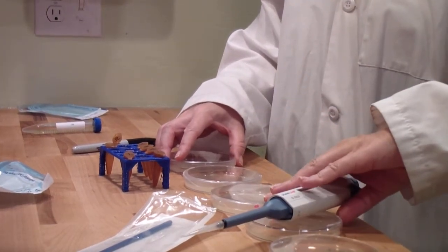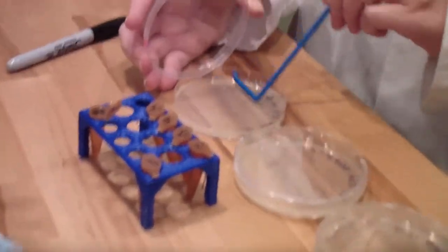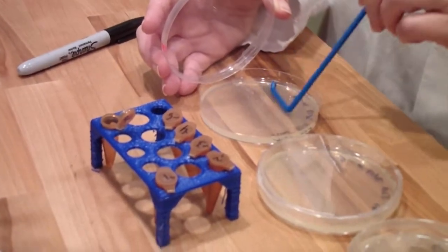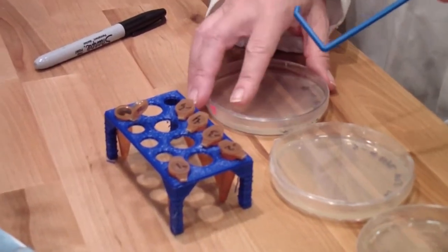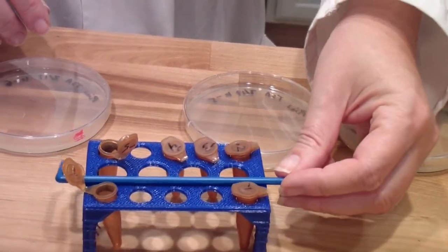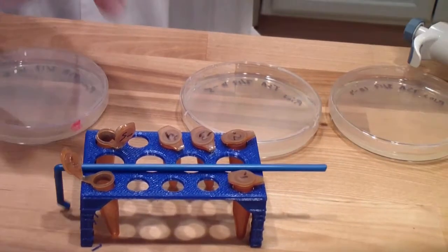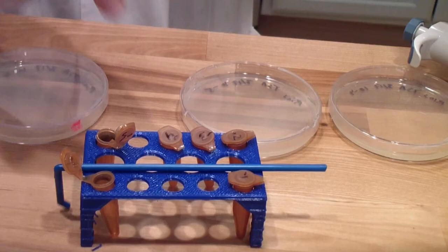Use the spreader to move the sample over the entire surface of the agar. Be gentle so you don't break the agar. Place the spreader over the edge of the tube rack, using the handle to secure it. Be careful not to let the end touch any other surface, in order to avoid contamination.